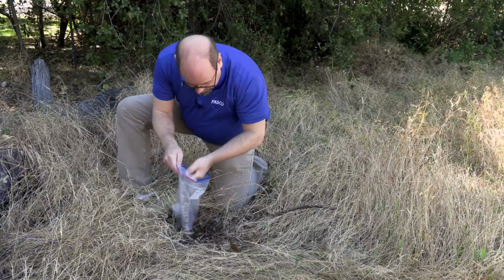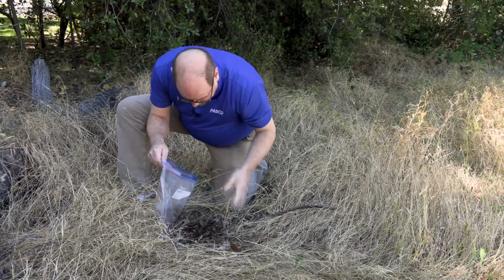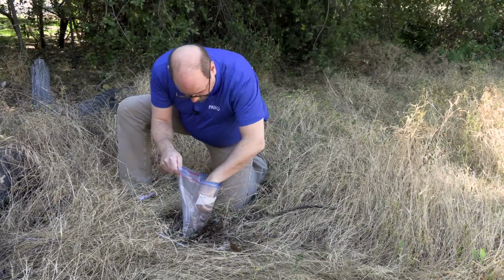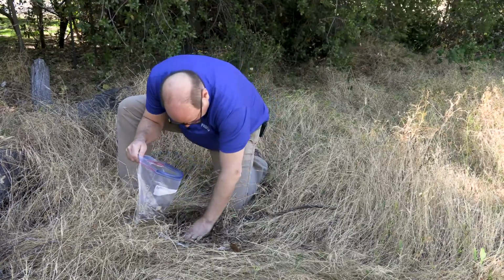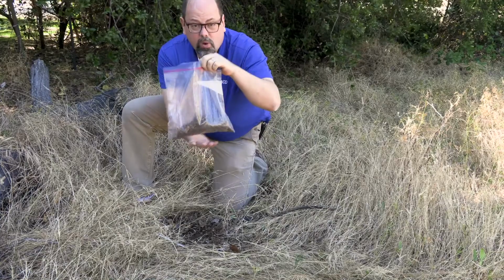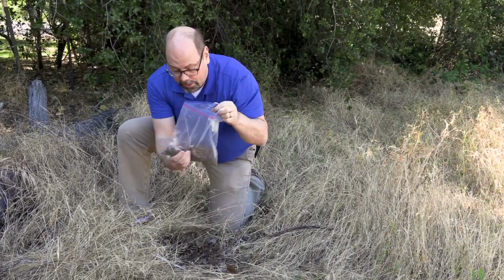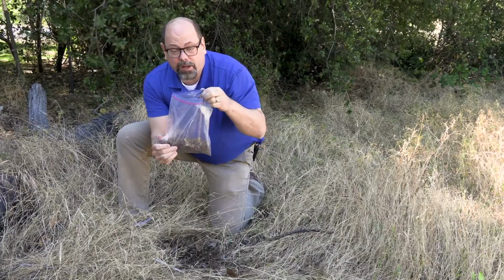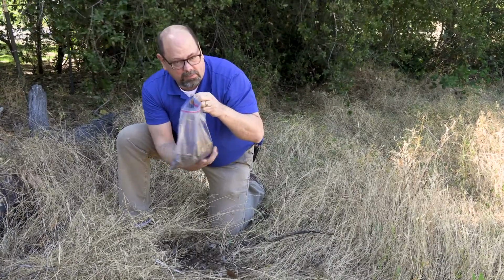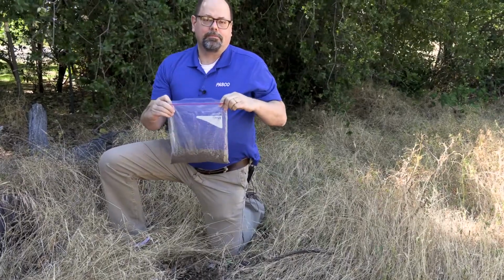Try to get as much of it as we can just to be the soil, okay? If it's surface materials, I'll take that out. Maybe one more, but we want a good, probably 1 to 2 cups of material that we're going to use to test when we get back inside. I'll go ahead and break that up a little bit so that we'll be ready for it when we get inside, when we want to mix it to see its both chemical and physical properties back in the lab.